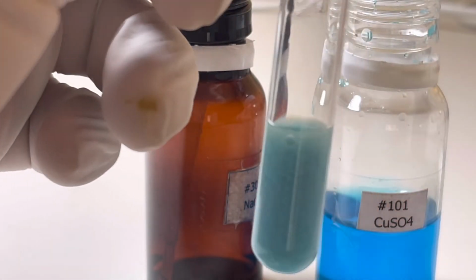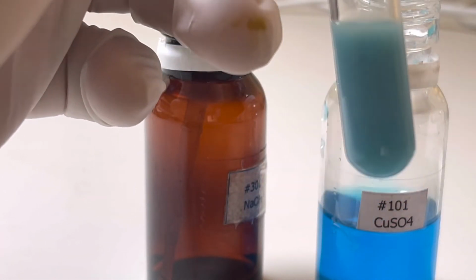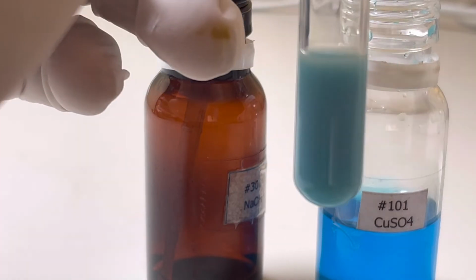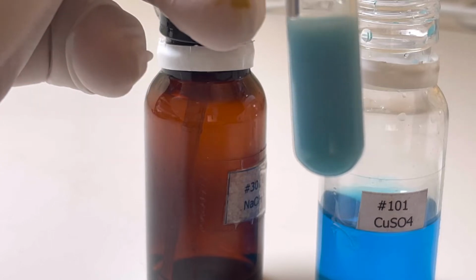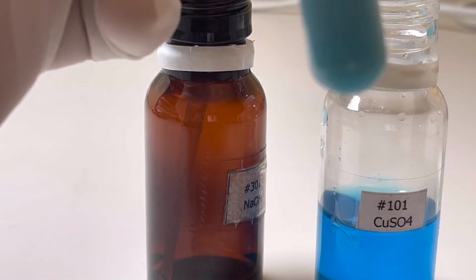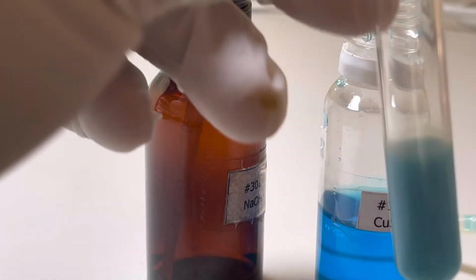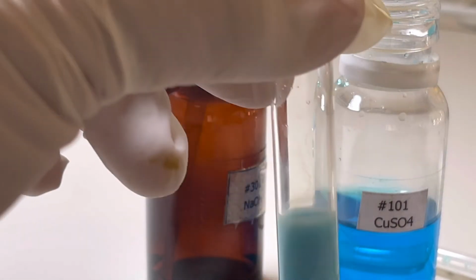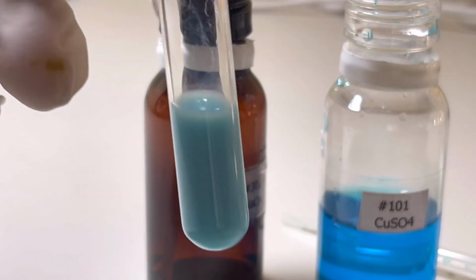This is the precipitation reaction. You got it? We got the precipitate, copper(II) hydroxide. Copper(II) hydroxide is here. You see it?